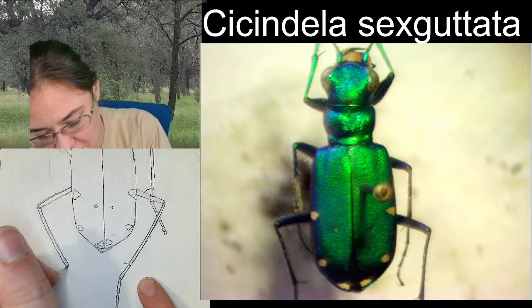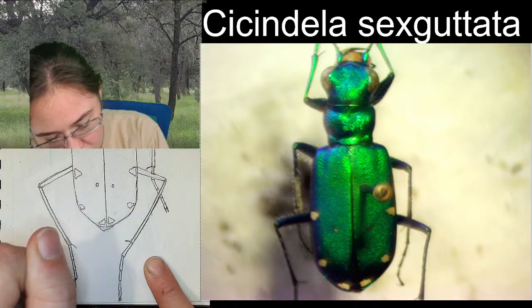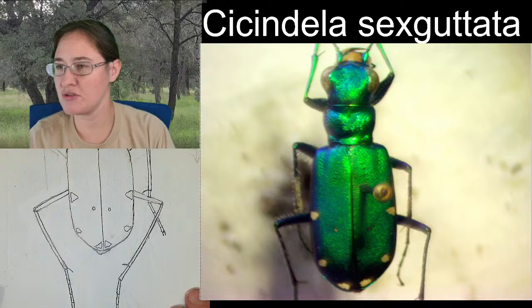Let's see, we've got this, and that's the end of our tibia, and then we've got the tibial spine, and then one, two, three, four, five. There we go, two legs there.